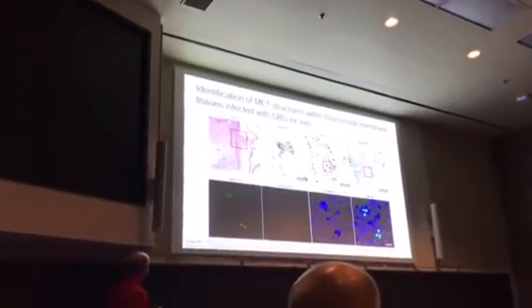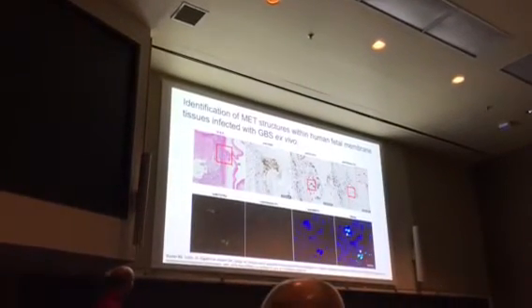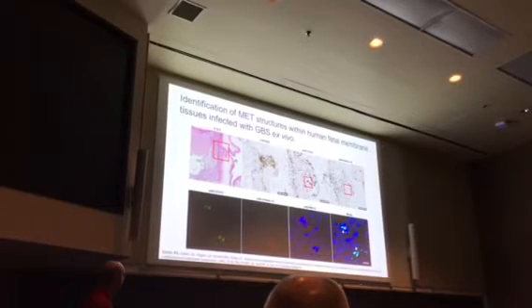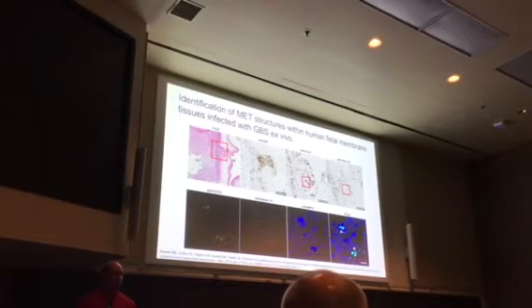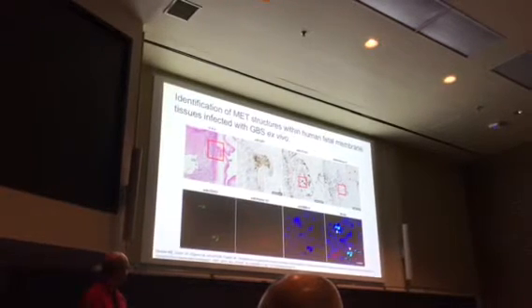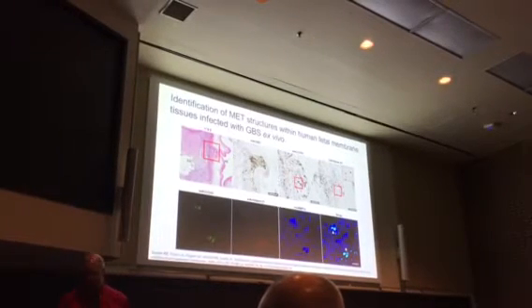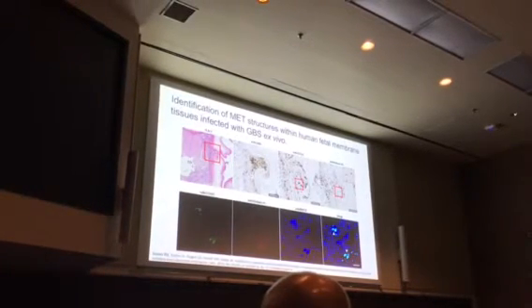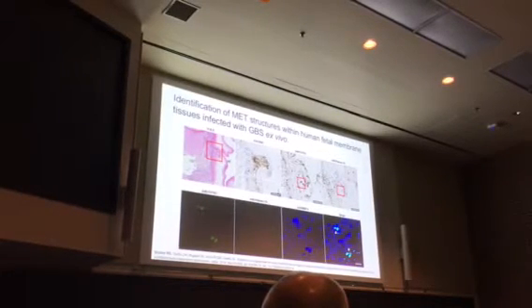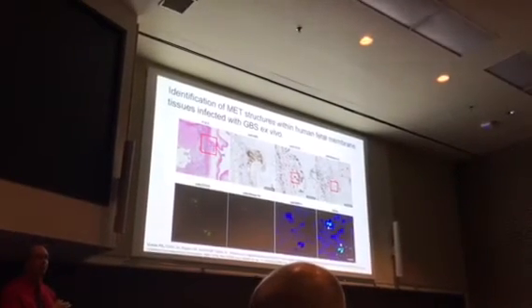If we look at this by immunofluorescence again, we can identify CD163 positive macrophages. And this time, we can see them dumping contents containing histones and MMP9, which we've shown are contents of the extracellular traps, again, into the extracellular space. You can see some red staining within the nuclei of other cells, and these tissues are making a lot of matrix metalloprotease 9. So we've shown that this extracellular trap response seems to happen within tissues.